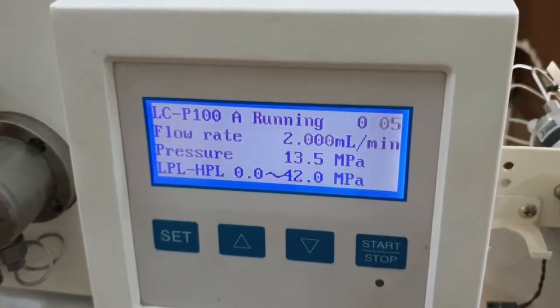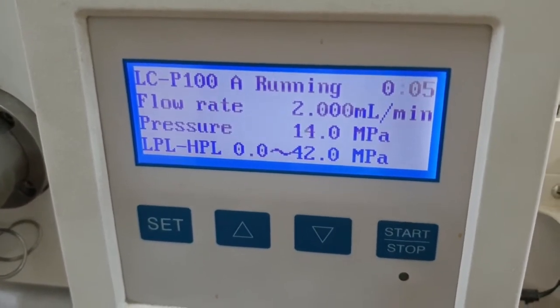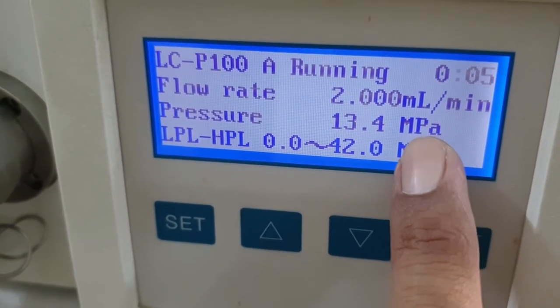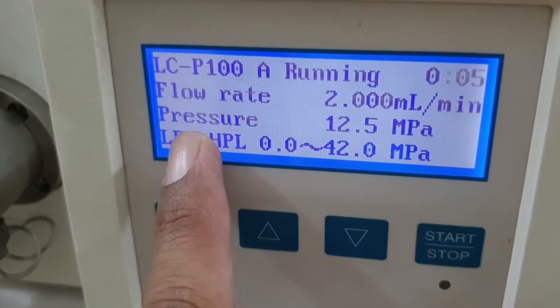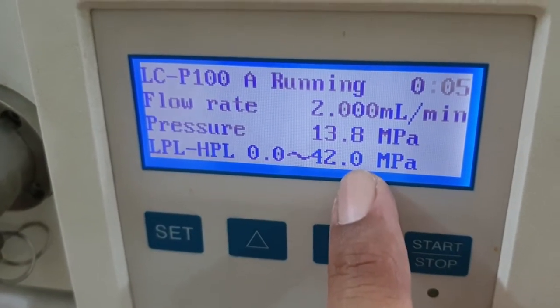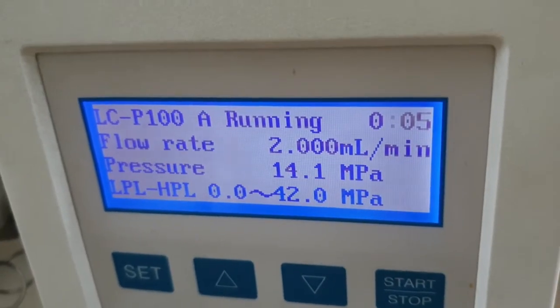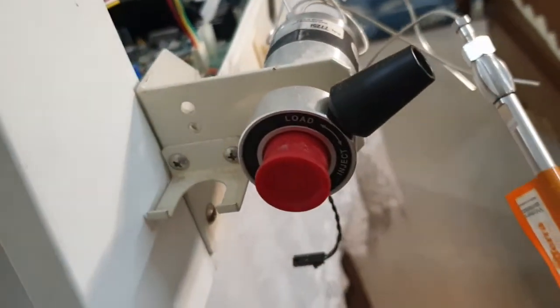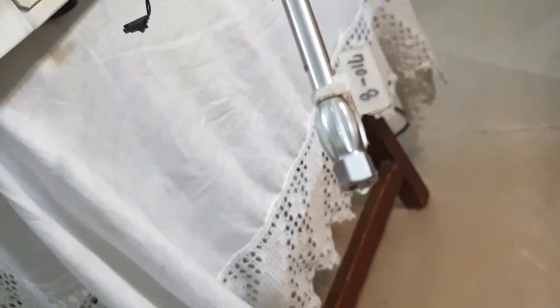You can see on the screen that the flow rate has been set at 2 ml per minute, and here you can see 13.2 megapascal pressure. The pressure is maintained and we have a limit of 0 to 42 megapascal. The pump is running and you can see the flow coming out from the end of the column.